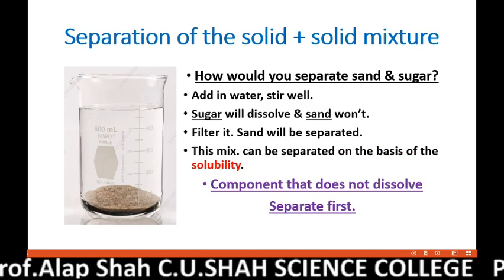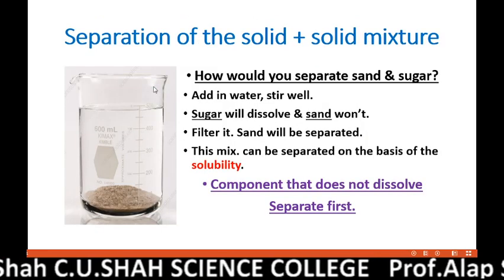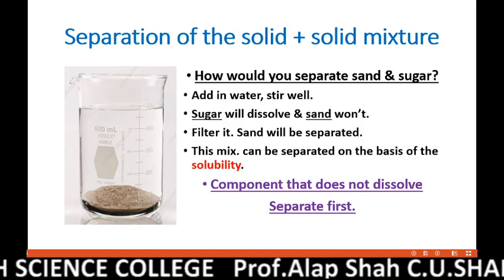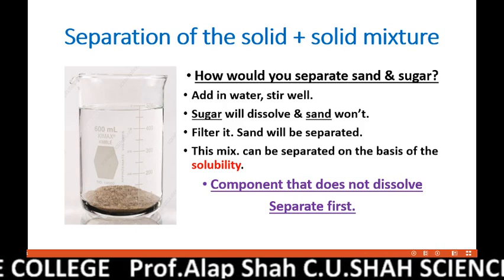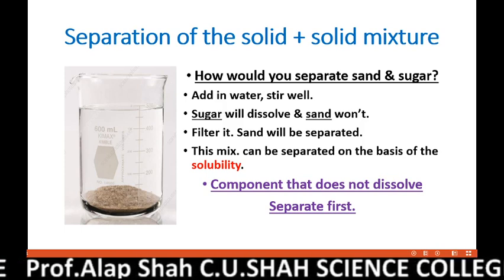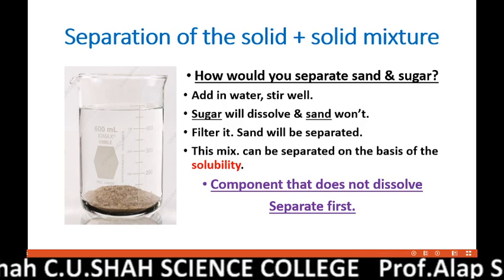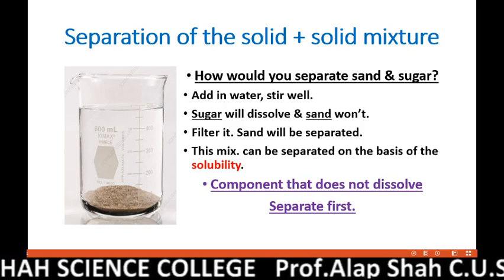First is, because I have written here that their separation is on the basis of solubility, so exactly what is it? Suppose we have sugar and we found that sand is also mixed with the sugar and we want to separate it. Mixture of sand and sugar. So what will we do? One way is if we have a selective molecular sieve, in Gujarati what is called chayani or charani, where there is a selective pore size, so it can restrict the sugar but it can pass through the sand, so that way you can separate it. Another method is just keep that mixture in a dish, and ants will pick the sugar particles, but I am just joking, though that is also one method of separation.